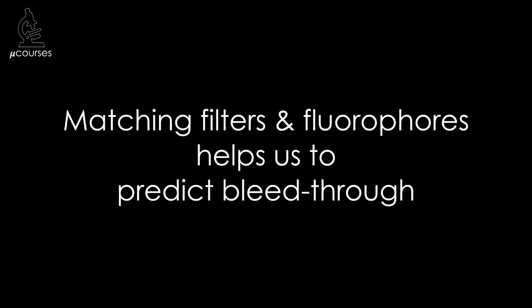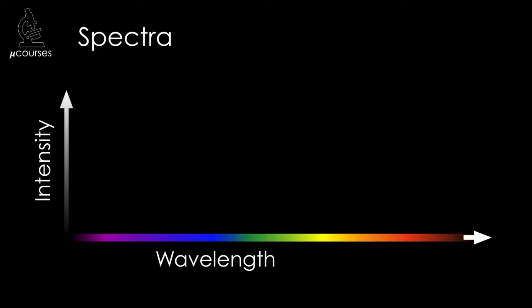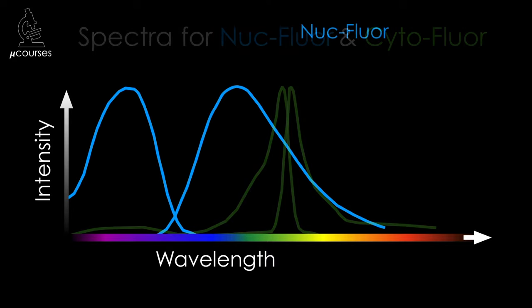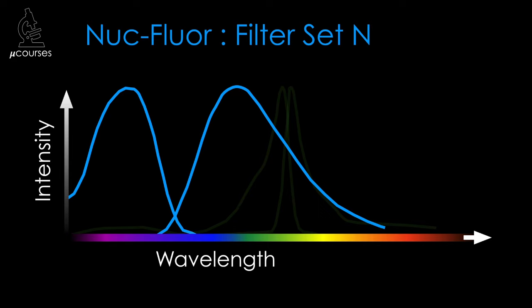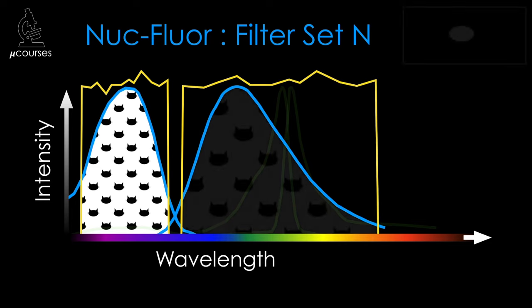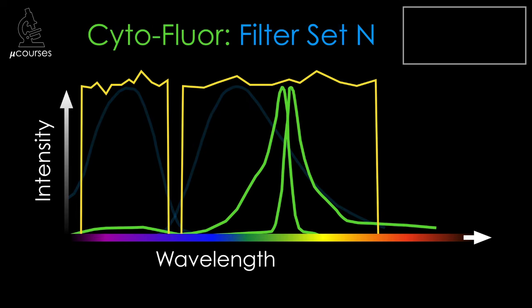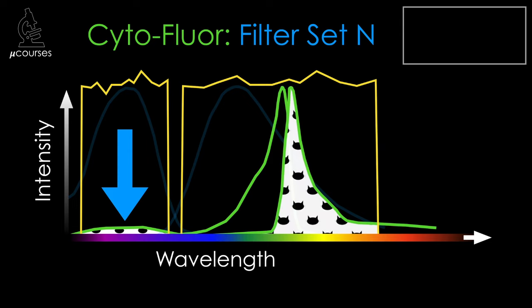Matching filters and fluorophores helps us predict whether bleed-through might occur. Let's take a look at the spectra for our example, labeled with nukeflor and cytoflor, focusing on the excitation and emission of nukeflor compared to filter set N. Filter set N contains an excitation filter nicely matched for nukeflor and an emission filter that collects nearly all of the emission light. We can also see that cytoflor is excited by the wavelengths transmitted by the excitation filter in filter set N, and the emission filter in filter set N transmits cytoflor emission — so bleed-through is very likely.